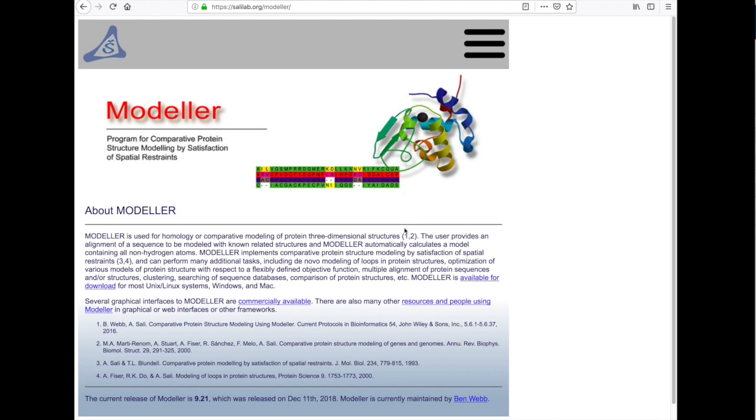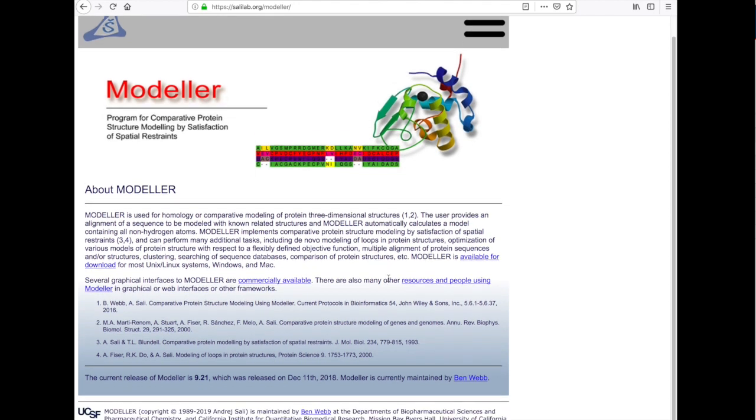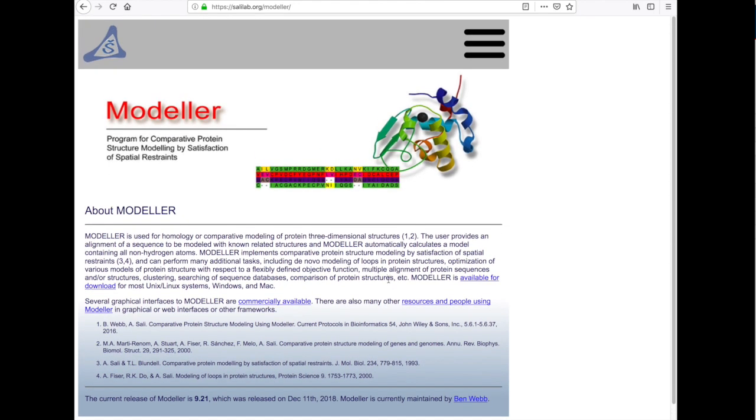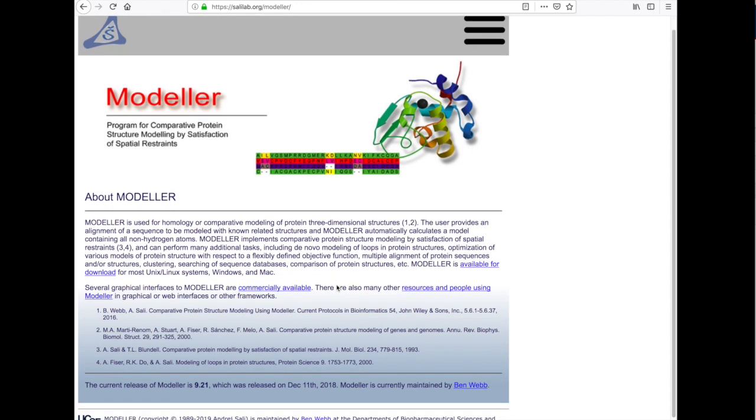Modeller is non-graphical software that can use your sequence and it will align the sequence of the template with your sequence and then build the three-dimensional model of your protein.